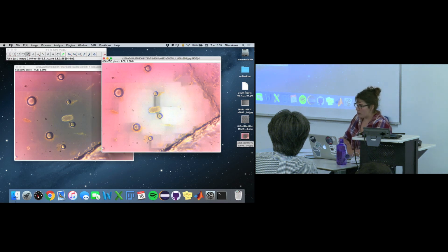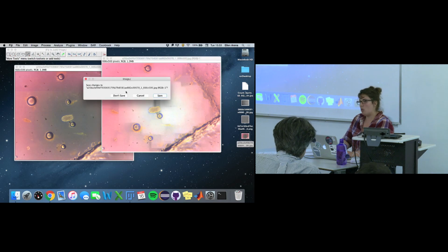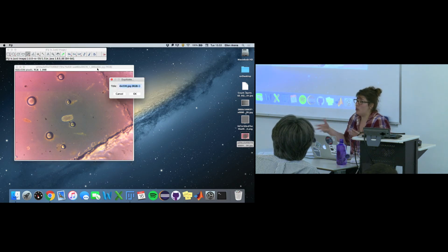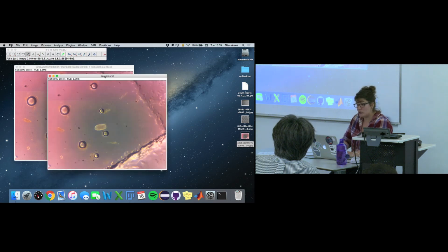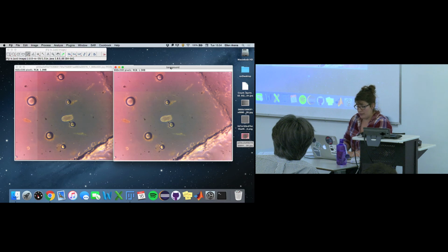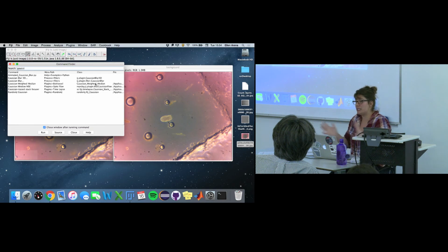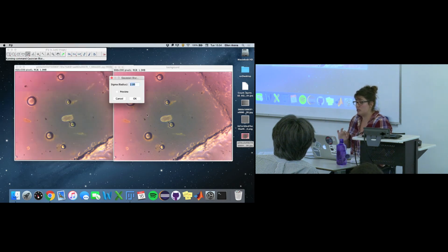So instead, there's another way we can actually subtract background. We're going to duplicate this image, and we can actually rename the duplicate background. So it's the same thing. We're going to apply our own filter across this image, just taking into account the background. So we're going to actually use the Gaussian blur again. But instead of that teeny tiny sigma, we're going to apply a large sigma. That's going to smooth over all the tiny little features across our image and really just highlight the overall changes that are happening on the image.